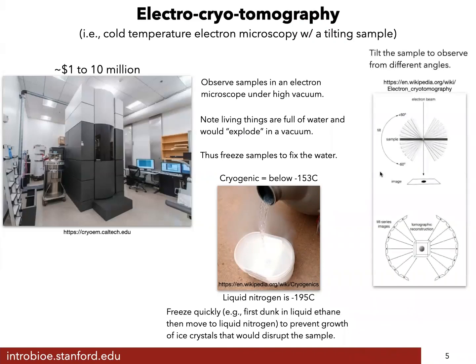Now the next thing is we're going to tilt the sample. If you're looking at something, look at your hand right now. What you're seeing is the light reflecting back off your hand, and you've got two eyes. So let's cover one eye. And now we're seeing the light, and your hand is a pseudo two-dimensional object, even though you know your hand's a three-dimensional object.